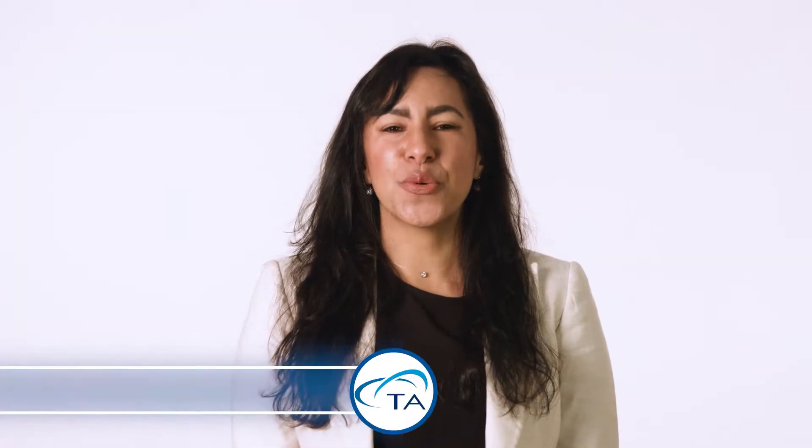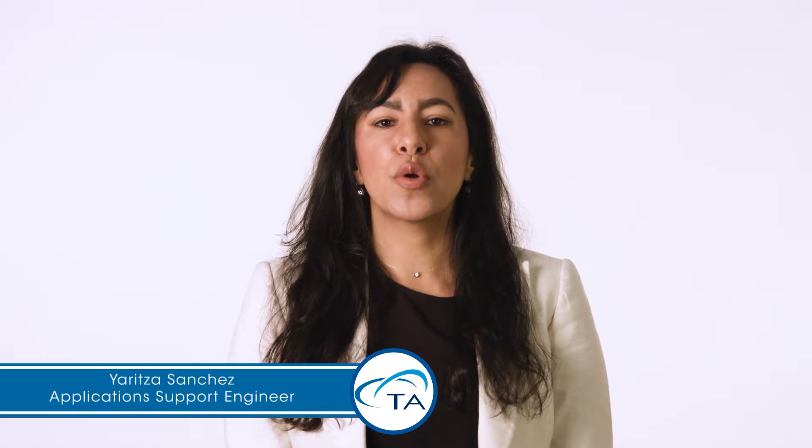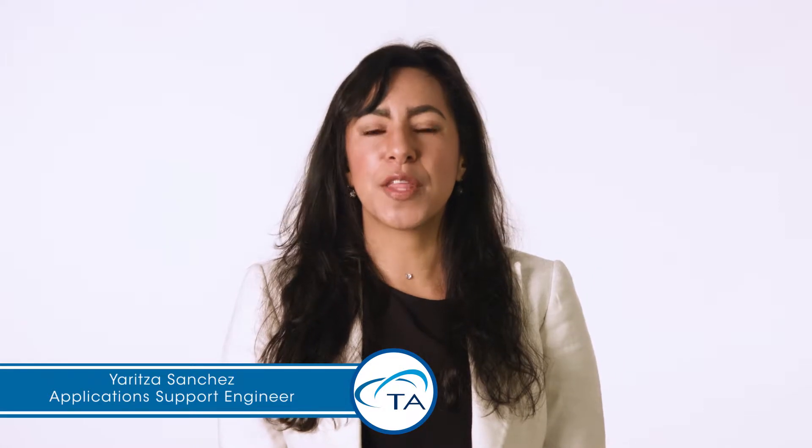Hello and welcome to another TA Tech Tip. In this Tech Tip we will show how to do force calibration on the Q400 thermomechanical analyzer.